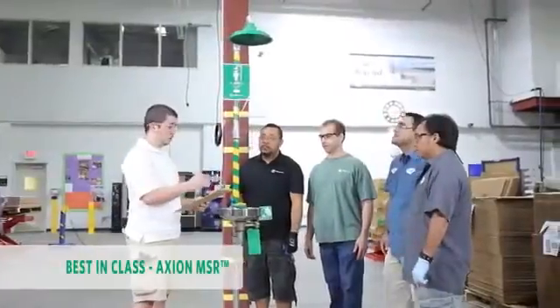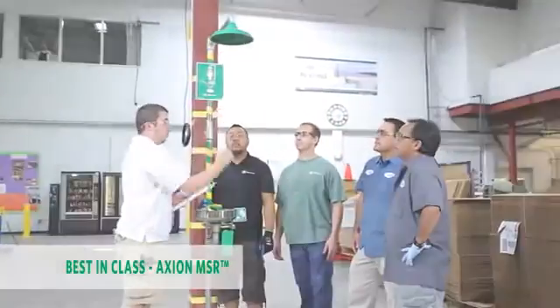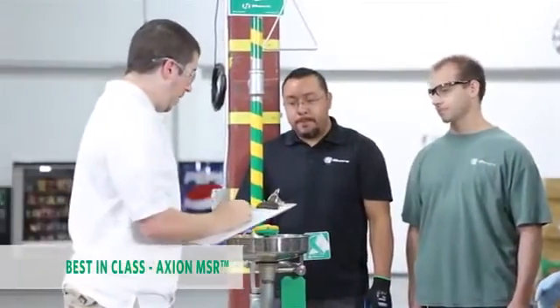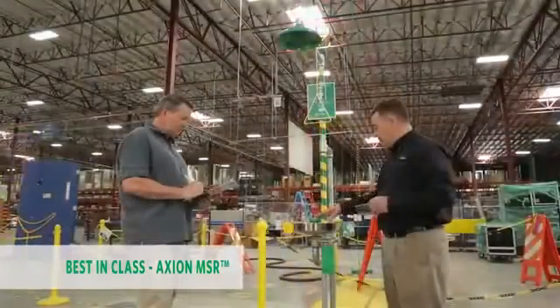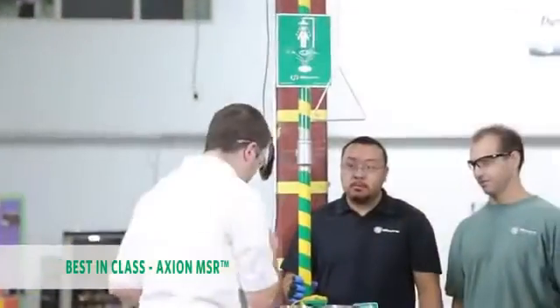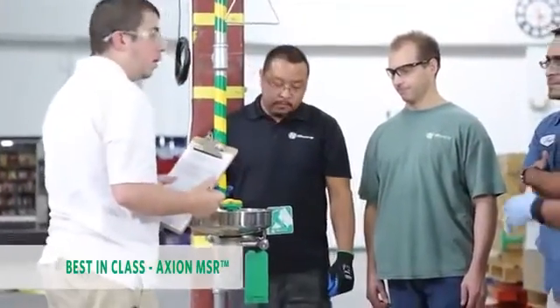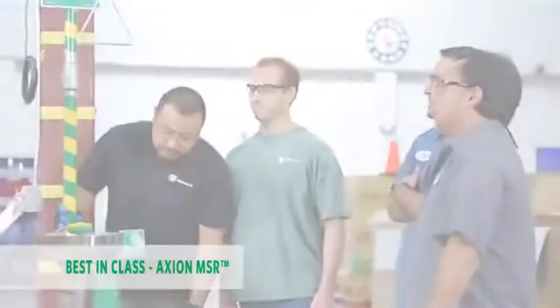To comply with ANSI standards at the best-in-class level and avoid potential serious penalties, manufacturers shall provide operation, inspection, and maintenance instructions for all eye face wash, shower, and combination units. Employees who may be exposed to hazardous materials should be instructed in the location and proper use of eye face wash, shower, and combination units.